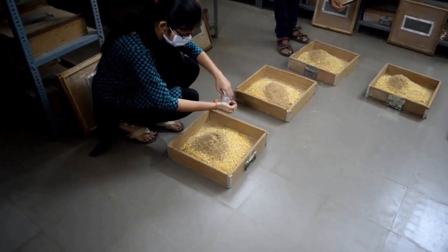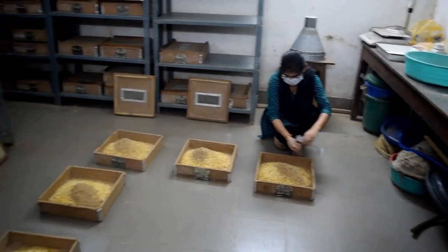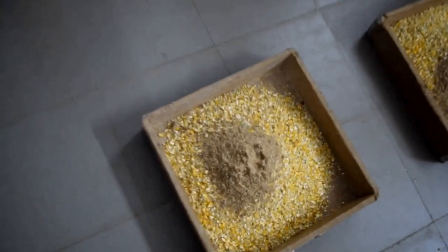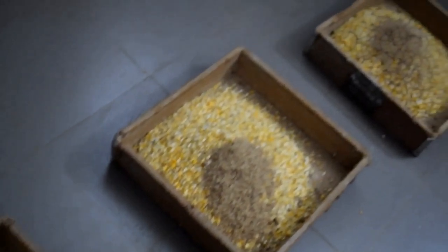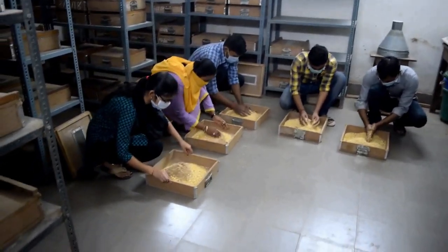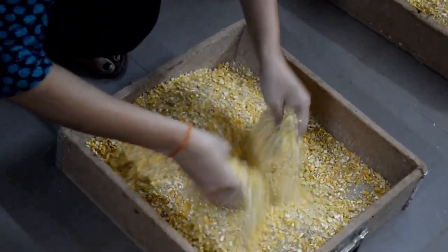Hence, to increase the moisture content to 14 to 16%, 30 to 50 ml water is sprinkled. The contents of the box are thoroughly mixed by both the hands.